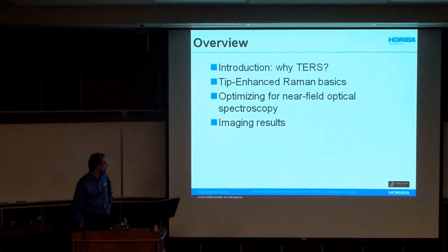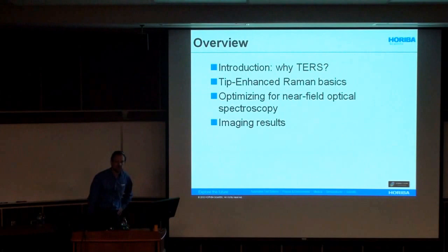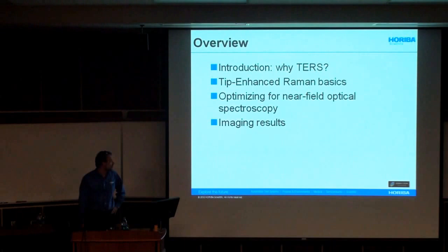So I want to go over, first of all, why TERS, why Tip Enhanced Raman spectroscopy, what is it and why are we excited about this technique? The Tip Enhanced Raman basics, because I'm not sure that everyone knows how that functions. And the core of the presentation will be about optimizing for the near-field optical spectroscopy couplings between AFM or scanning probe microscopy and Raman spectroscopy, confocal Raman spectroscopy. And I'll finish with the latest results in terms of TERS imaging.